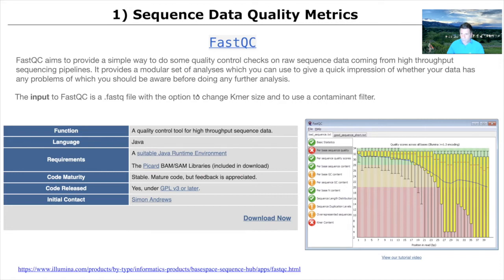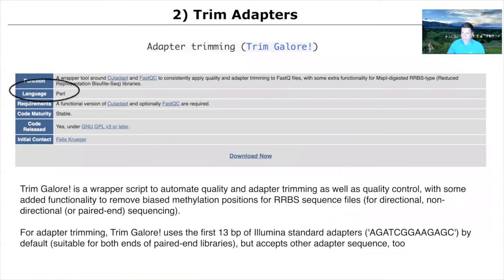But you can dig into this more. This is just the first step, which says, hey, how do your reads look? And can I align them? So then we want to trim those adapters that we had just mentioned, which we put on to help get it on the glass and sequence it.